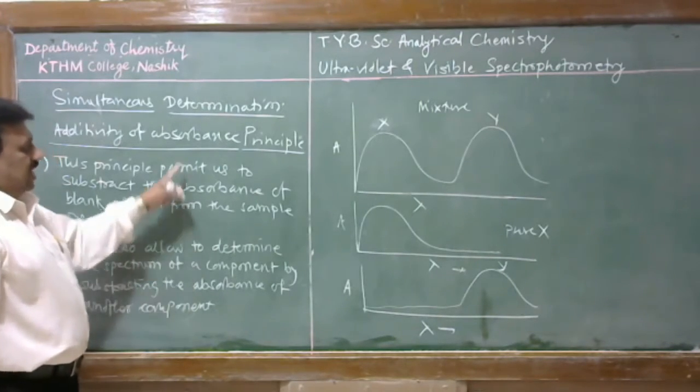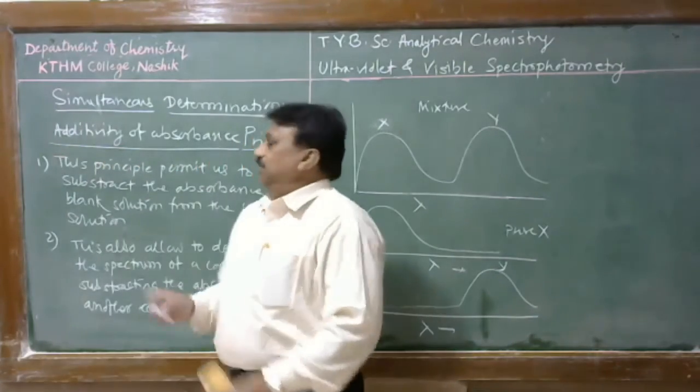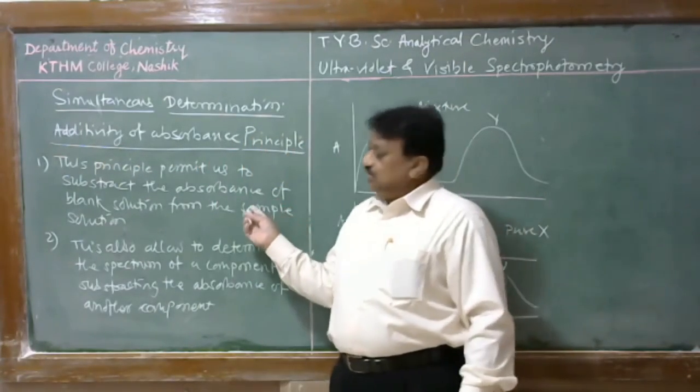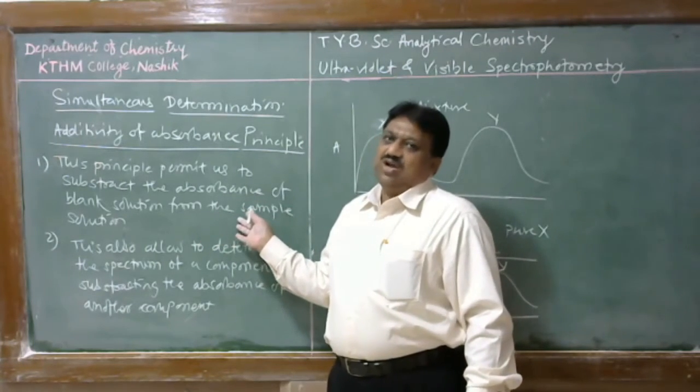That means it allows us to subtract the absorbance of the blank solution from the sample solution. Blank solution means the solvent components or other reagents.